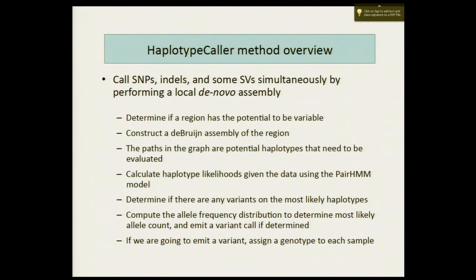Sorry. Just to complement that, for example, with Unified Genotyper in 1,000 Genomes, we achieved a false discovery rate of less than 1% for SNPs. So for SNPs, it's really, really good. For indels, our false discovery rate was maybe 5% to 10%. But the other thing is that we didn't discover with Unified Genotyper any of these large variants that HaplotypeCaller is now discovering. So in that sense, this is doing infinitely better than that. That's a much more analytical answer.